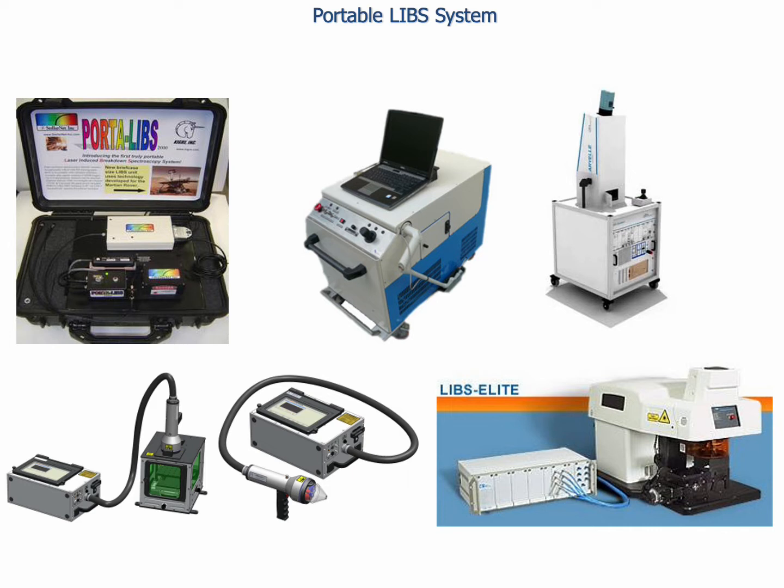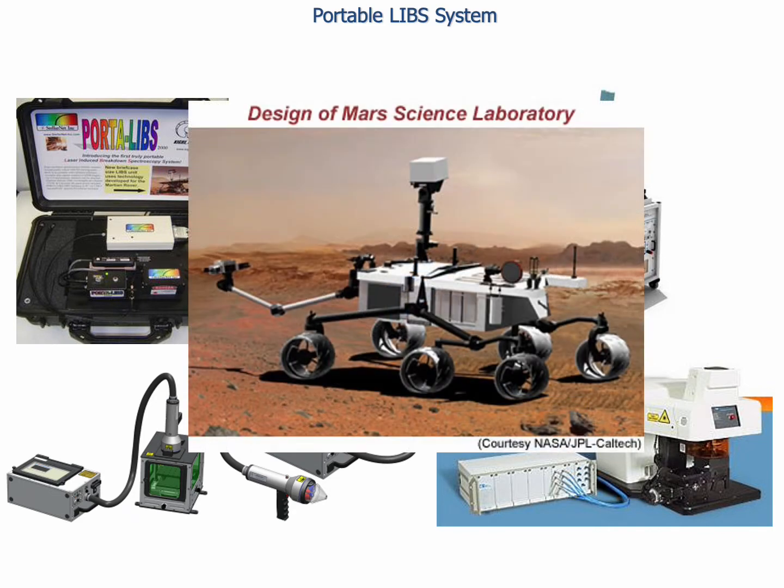Over the years, several different portable systems have been assembled due to the increase in requests for fast, reliable, and low-cost instrumentation for analysis. Recently, as you probably know, rather compact prototypes have been sent to Mars to analyze the surface of the red planet.